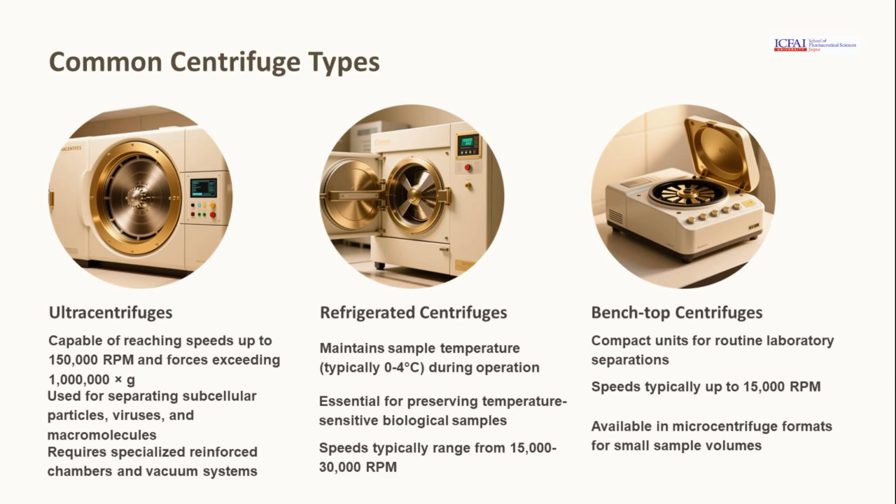Centrifuges come in various types, each suited for different applications. Ultracentrifuges reach high speeds for separating subcellular particles, refrigerated centrifuges maintain sample temperature for sensitive samples, and benchtop centrifuges offer compact solutions for routine laboratory tasks. Each type serves a unique purpose in scientific research.